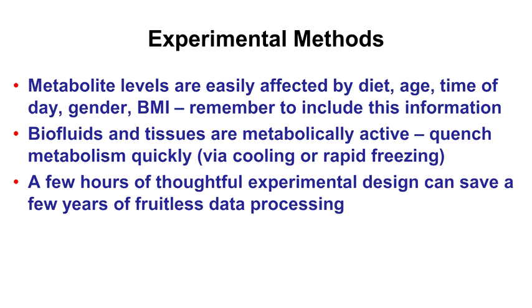In many cases, NMR or any metabolomic experiments are essentially done as an afterthought. Someone's collected a lot of samples and says, hey, I've got something that's been sitting frozen for 5 years. Do you want to look at this? And if you find out that, in fact, the samples were never quenched metabolically, or that they have been frozen and thawed 100 times, or that there are different collection protocols by different labs and they're all pooled together, you won't find anything. There's going to be too much noise.